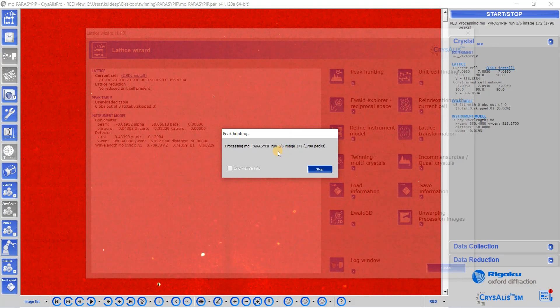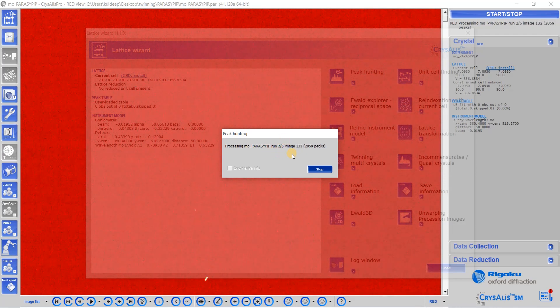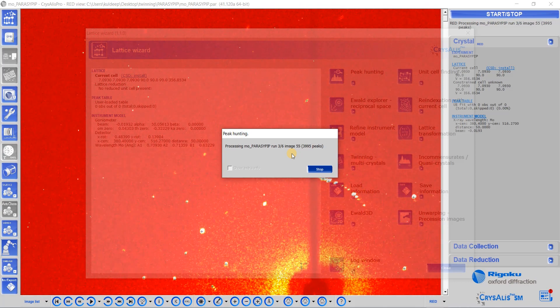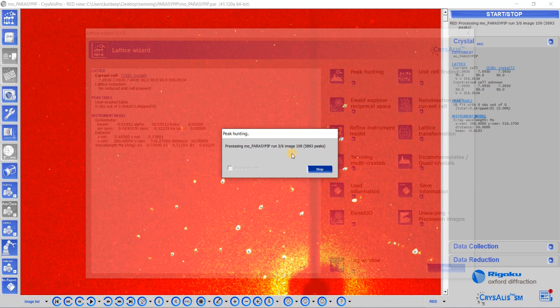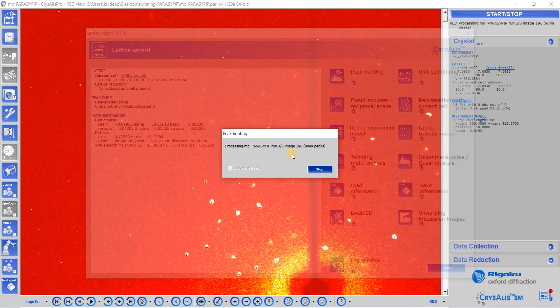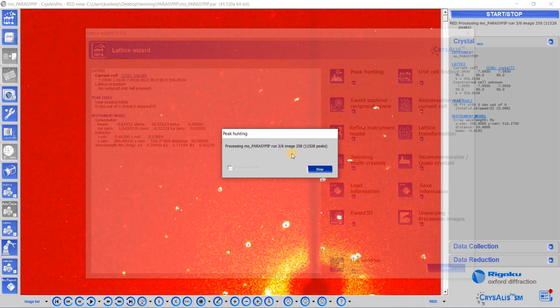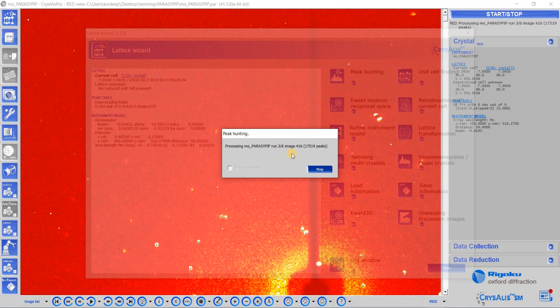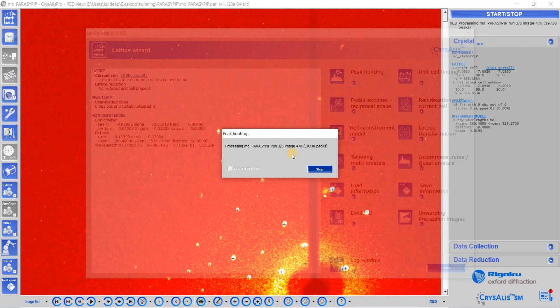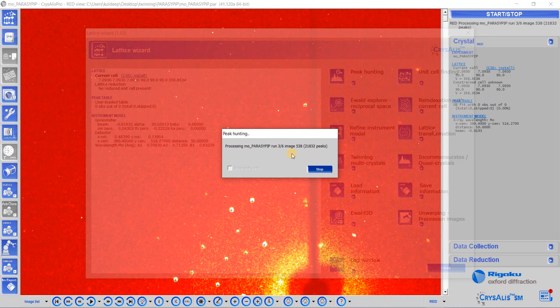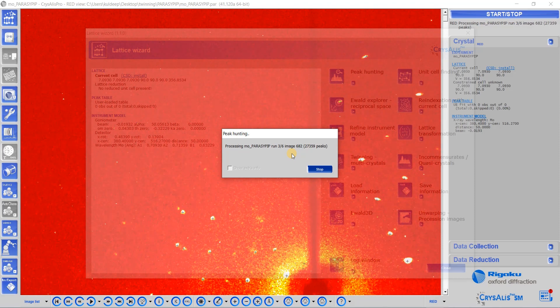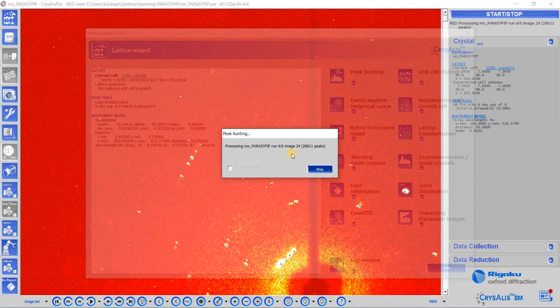The data has been collected in six runs. There are a total of six runs, and each run has some 200 to 400 images. It will go through all the six runs and all the images. Run three is in progress, then run four, run five, and run six. I am doing it in real time so you can see each and every run.